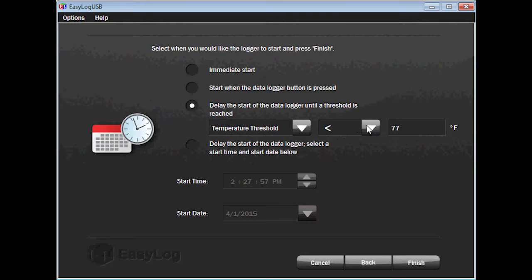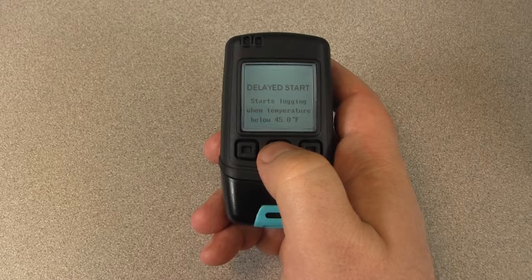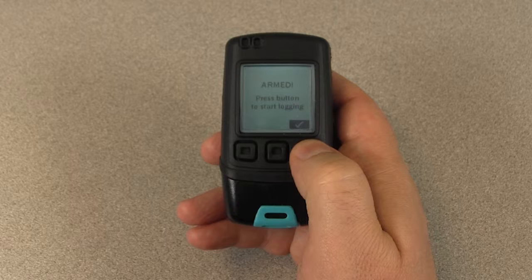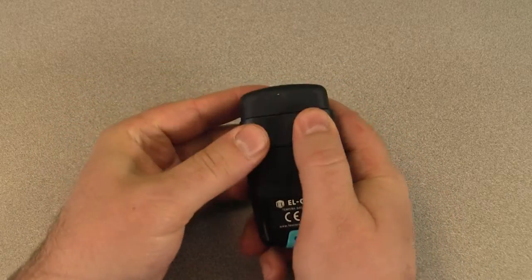I will set it up so that the logger will not begin recording until it reads the temperature under the configured high alarm setting. When done, click on Finish and remove the logger from the USB port. If you choose to start the data logger after a threshold has been met, you will see Delayed Start at the top of the screen along with the condition that must be met — in this example, when the temperature is below 45 degrees Fahrenheit. If you choose to delay the start, you will see Delayed Start along with the date and time when logging will begin. If you choose to start when the button is pressed, you will see the word Armed on the display, and you will need to push the button below the check mark to begin recording. Place the cap back over the USB connector and place the device in the desired location.